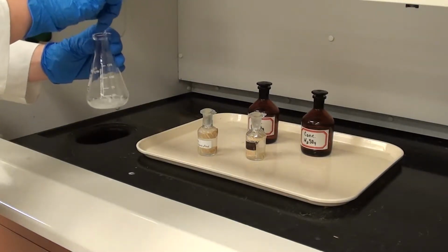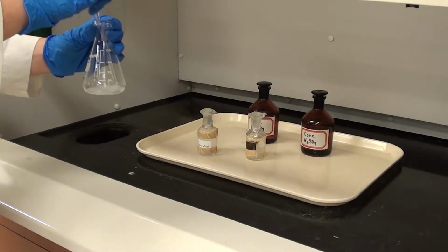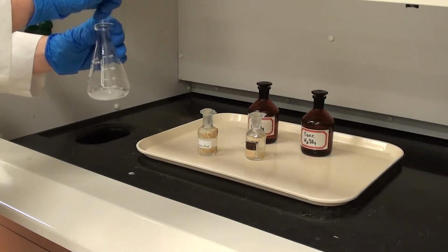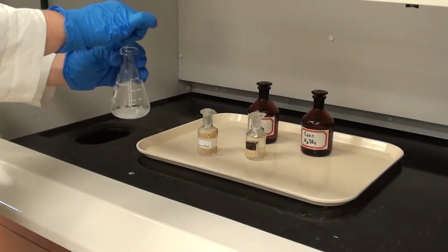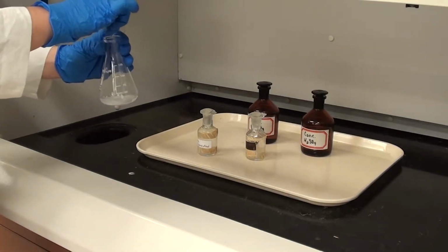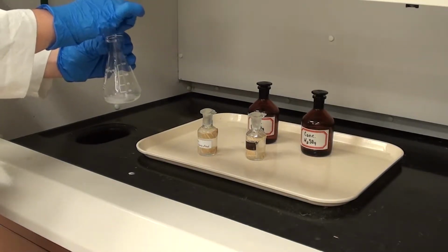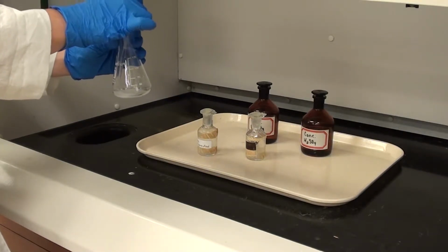So if you look at Cassie's technique as she's stirring, she's kind of just poking the stuff down into the solution there and stirring it with the stirring rod. You'll notice she's doing it in the fume hood, and the reason for that is because it is a bit stinky, and often doing it in the fume hood can save us some grief, especially if you're sensitive to acetic acid. Some people are.